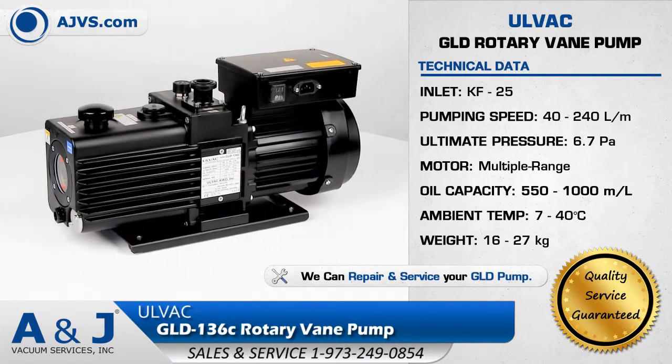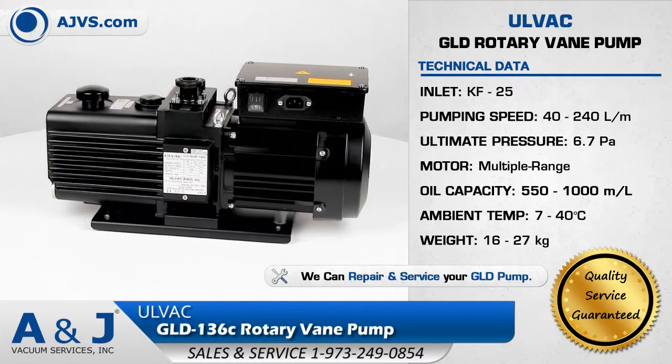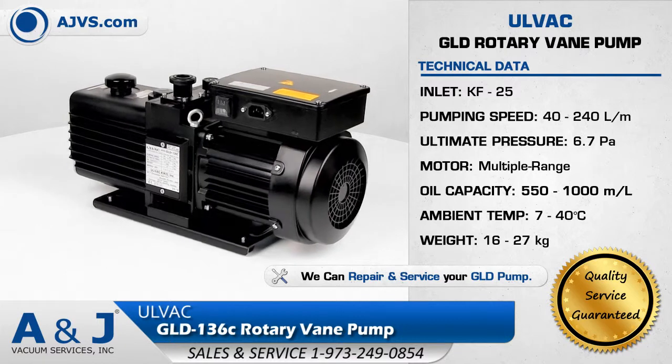The Olvac GLD has a pumping speed range of 40 to 240 liters per minute and operates at low noise levels. It has a multi-voltage motor and long service interval.